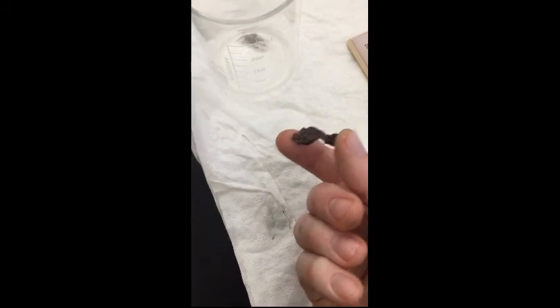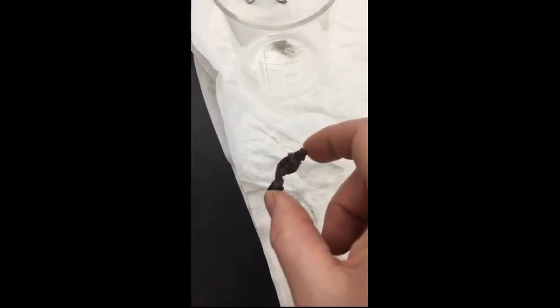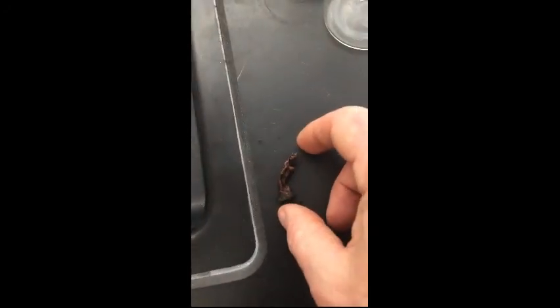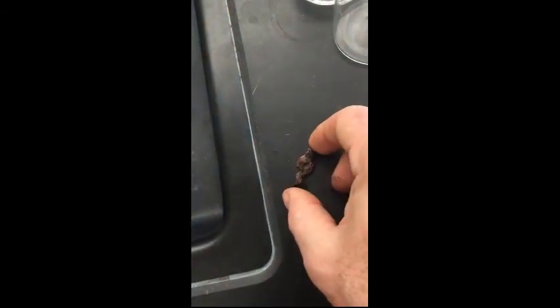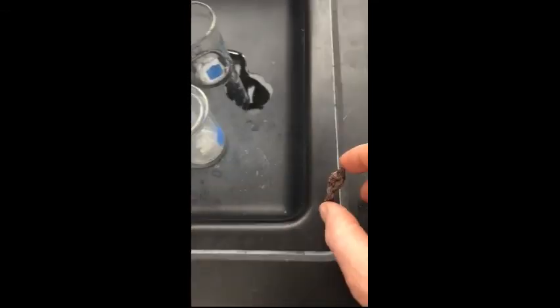Okay, can you see that there's a reddish hue to this? It's darkened for sure, but it also has a red hue to it. Might be able to see it better actually there. Okay? It's got a reddish hue because the copper ions there ended up on the zinc. Okay?